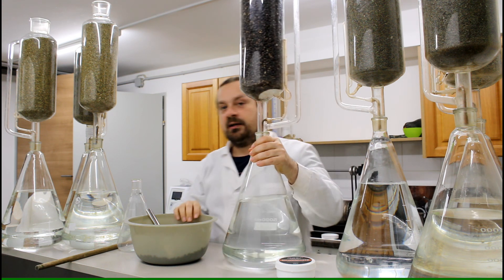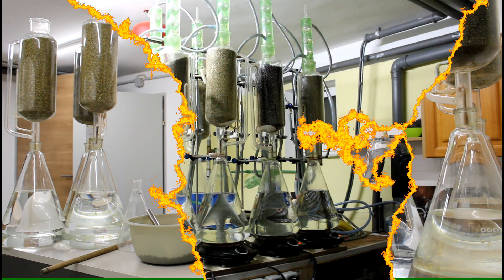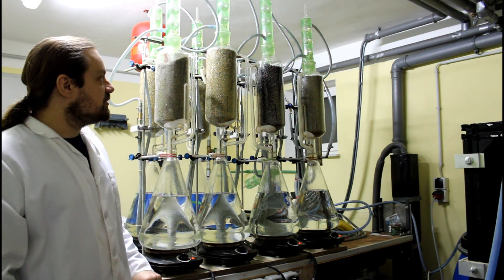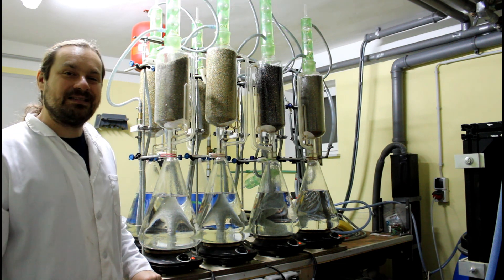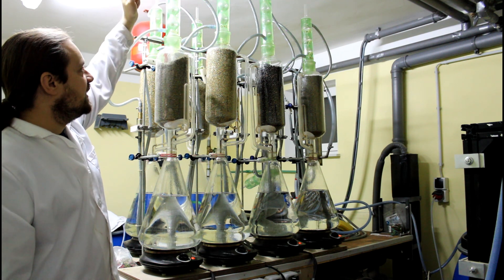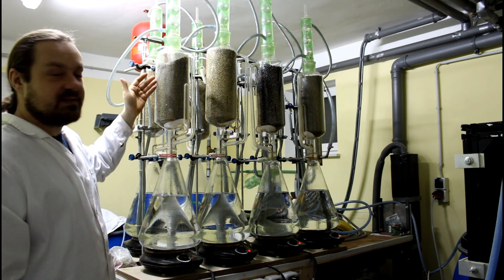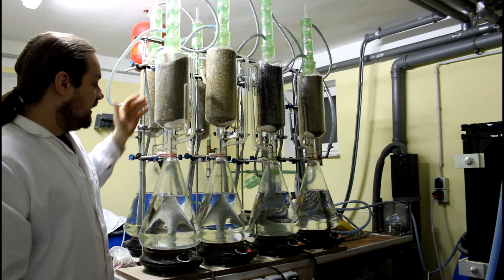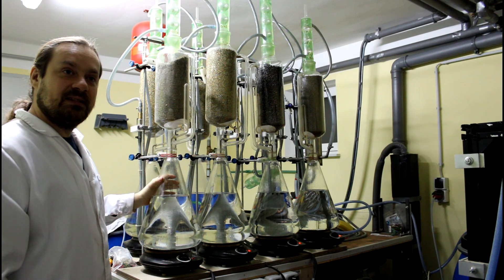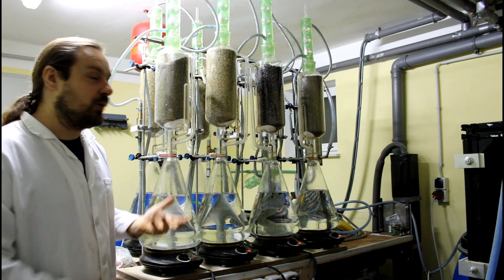Now we're ready to completely assemble the whole Soxhlet system. As you can see, the entire system is now assembled together. You can see the three parts: the water-cooled condenser at the top, the extraction tube in the middle where extraction happens, and the boiling vessel at the bottom where concentration, evaporation, and boiling occur.